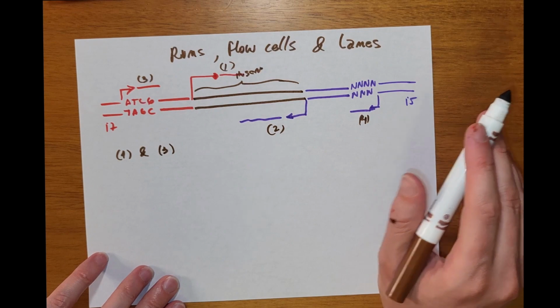So that gives you a lot of flexibility, but here there is an issue that is very practical, and this is important so that you understand what the constraints of the sequencing facilities are. Each run is done on what are called flow cells, and each flow cell has 2 or more lanes. In each lane, you can put a mixture of independent samples. So you can run your barcoded mix of samples in one lane, and then another group doing something completely different will run in another lane their own barcoded mix of whatever they did. Those 2 sets of reads will never be in the same lane, and they will not be mixed, and they will be independent.